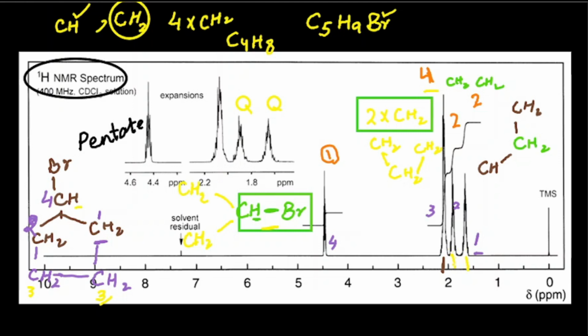Okay, now if you see their chemical shift value are not that different. If you see here, it is somewhat in the range of 1.7 to 1.8 ppm value, and it is in the range of 1.8 to 1.9. It means that the difference between them is less than 1 ppm value. So it means that it has the same chemical environment, but their chemical environment is somewhat shifted due to some kind of the atom that is present.